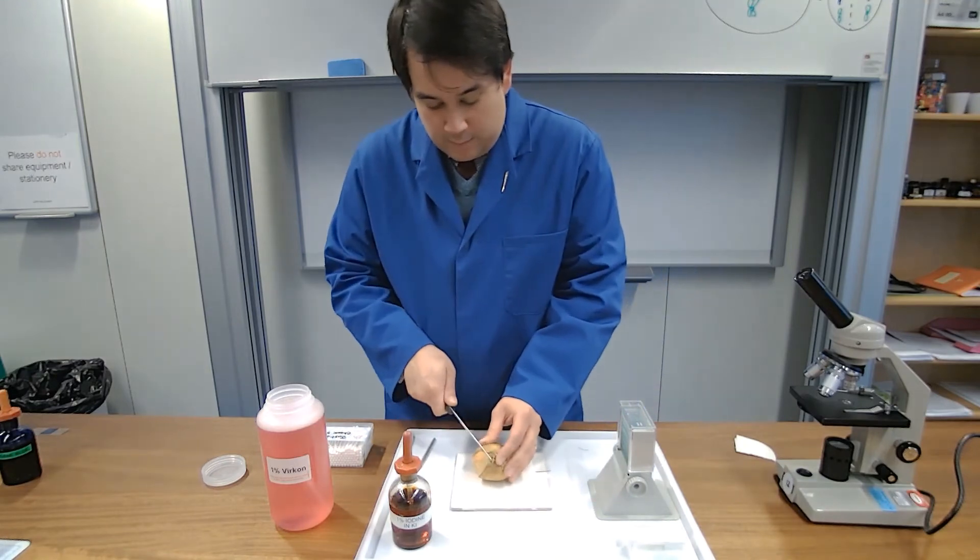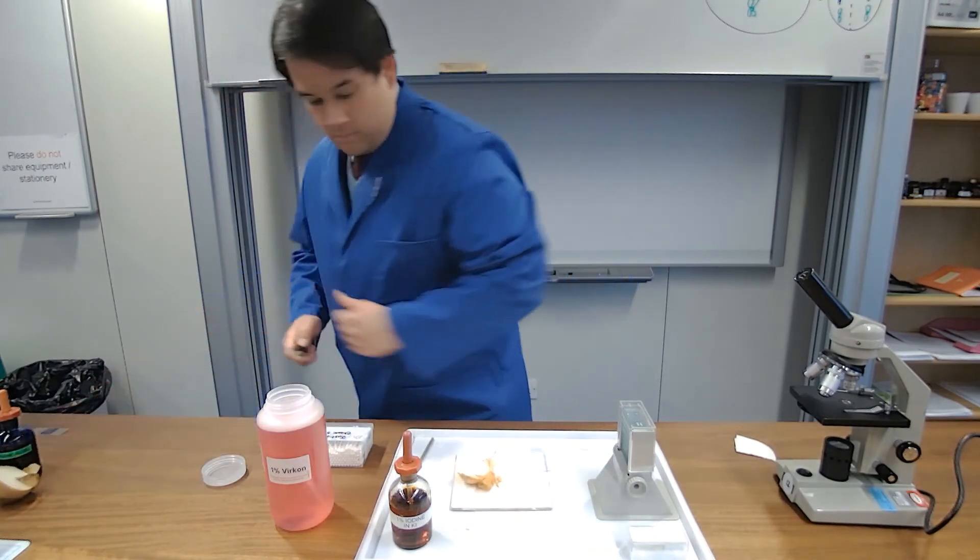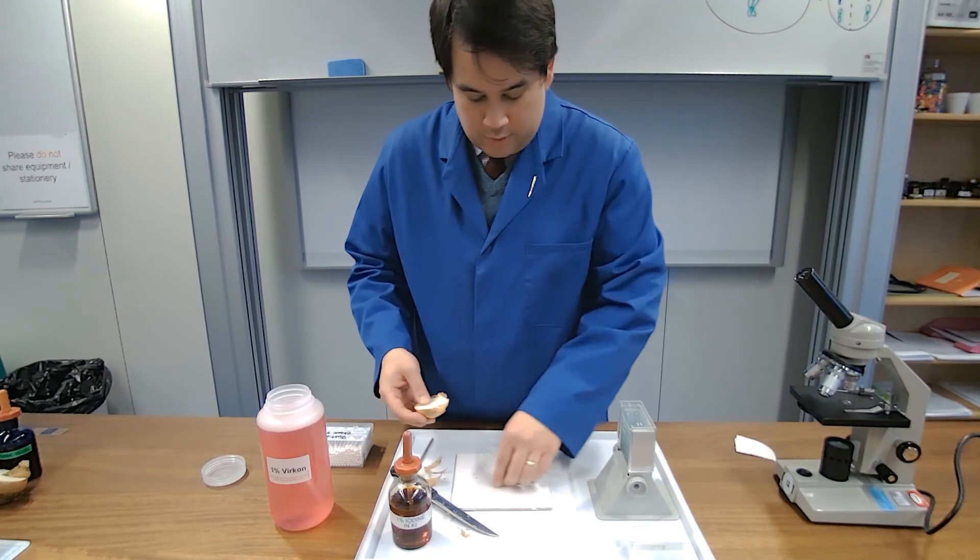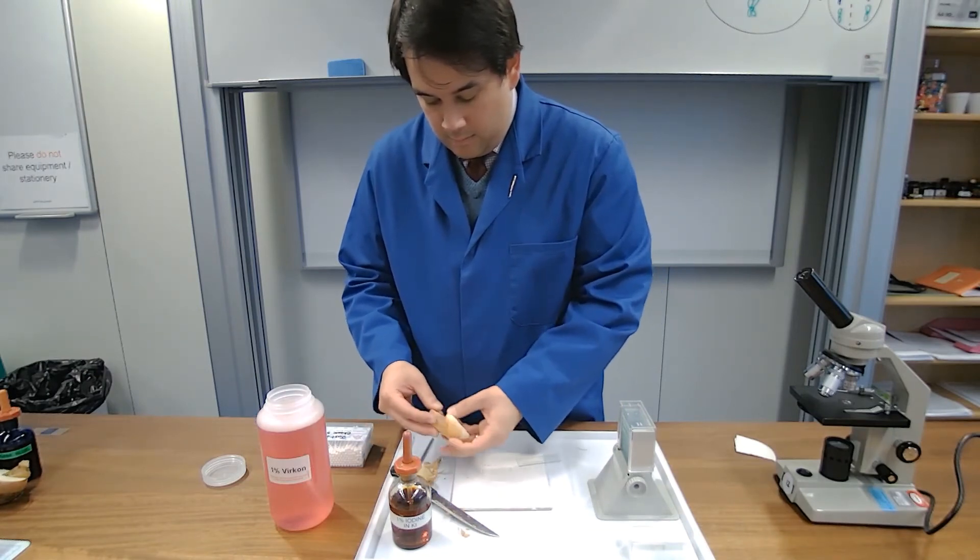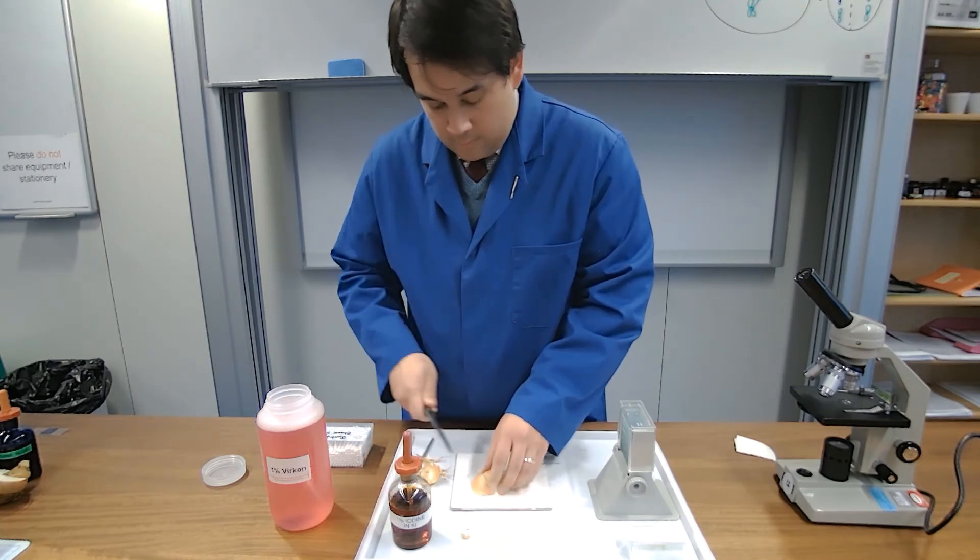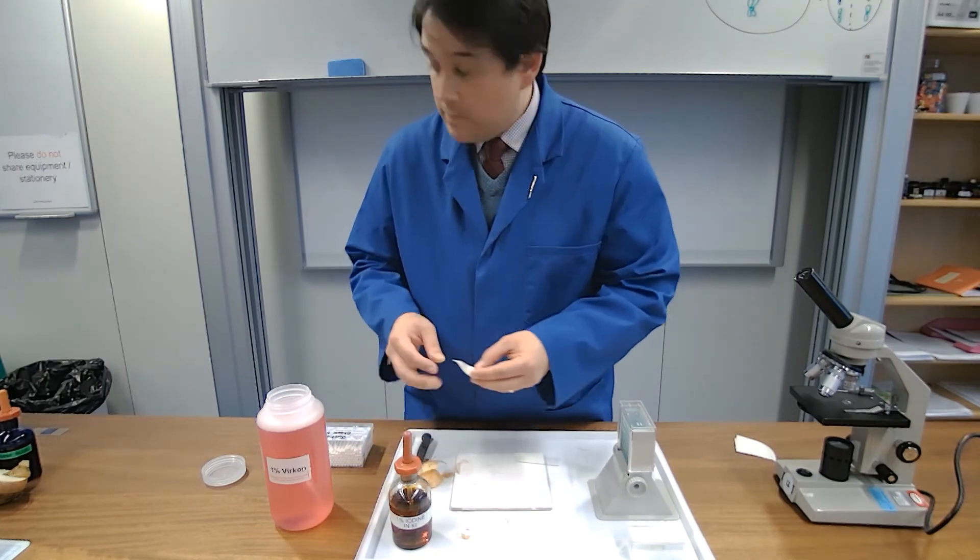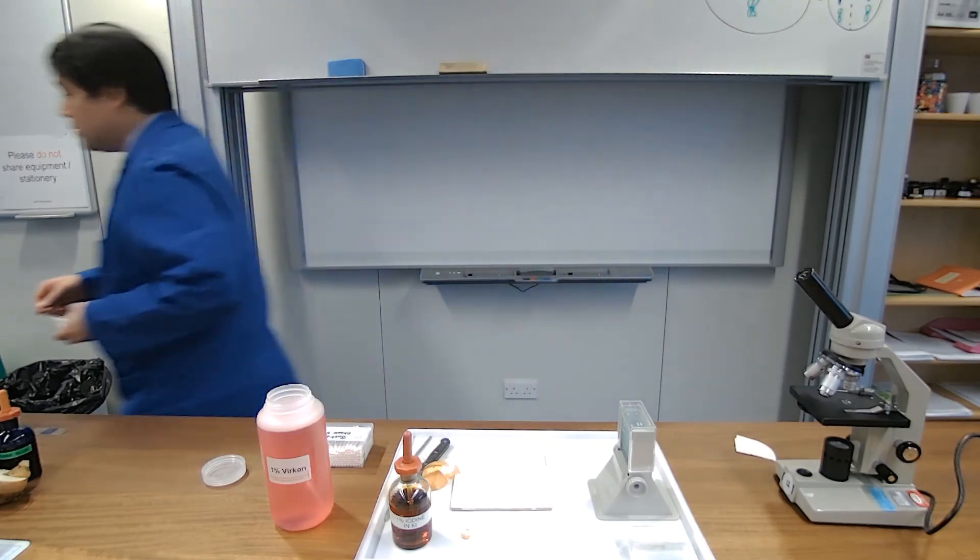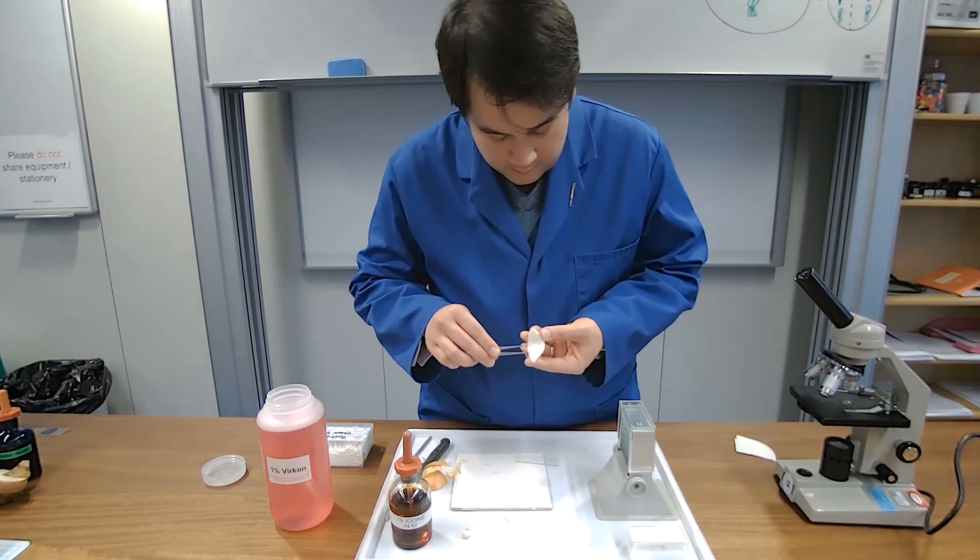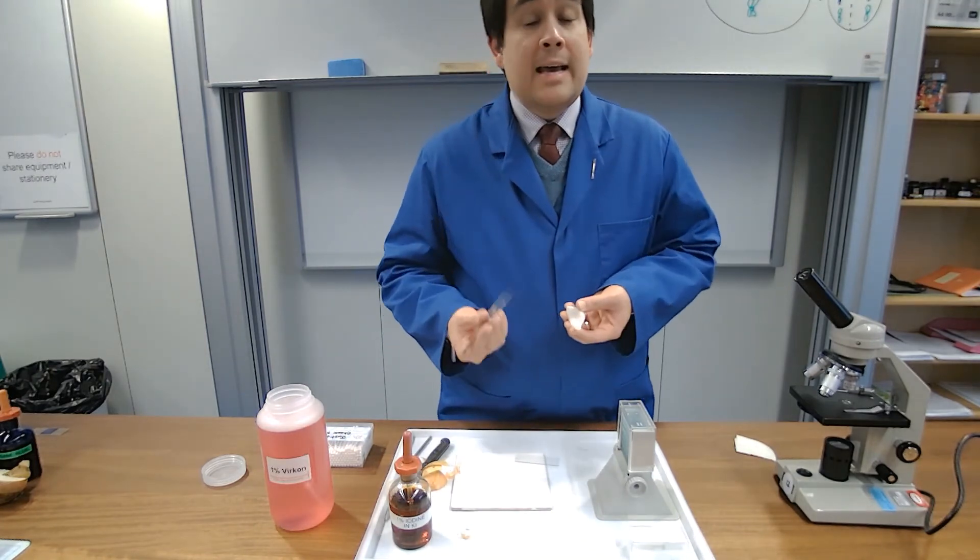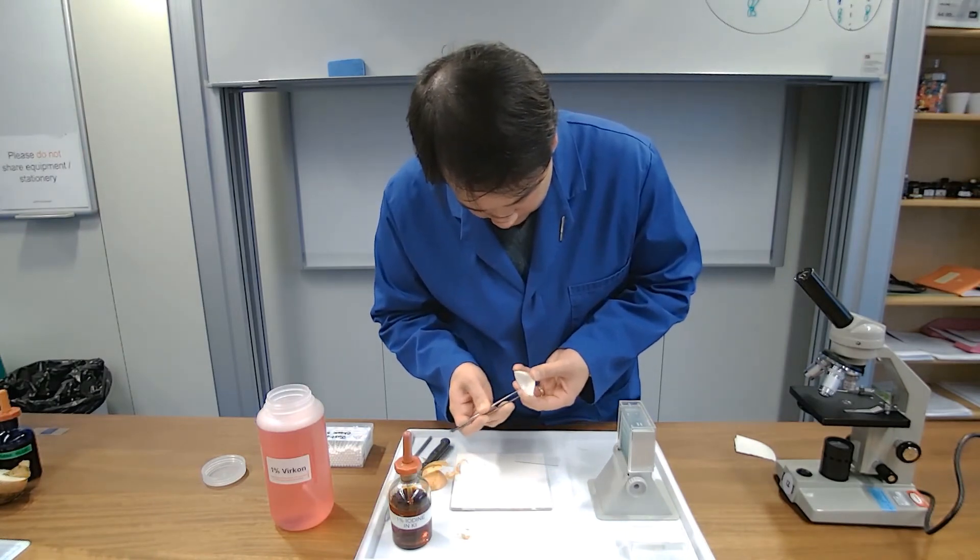So once again slide in readiness and cover slip ready to go. If you just cut a small section of this, we're going to be able to use just a small thin layer of the onion. As you can see the thinner the section the better because light needs to pass through the specimen.